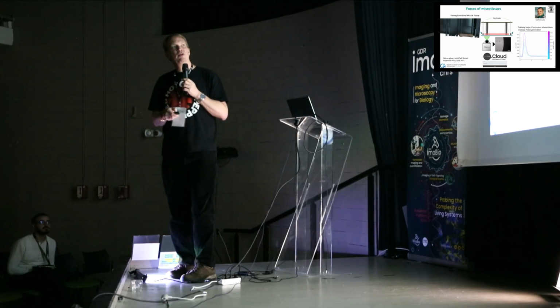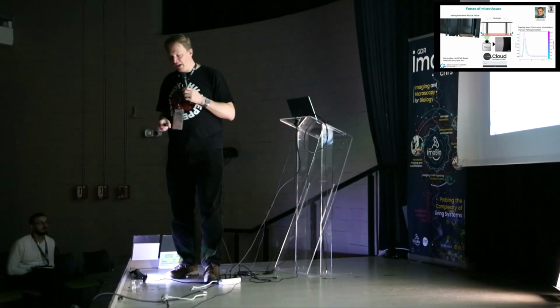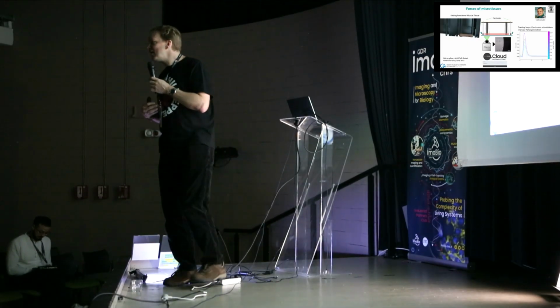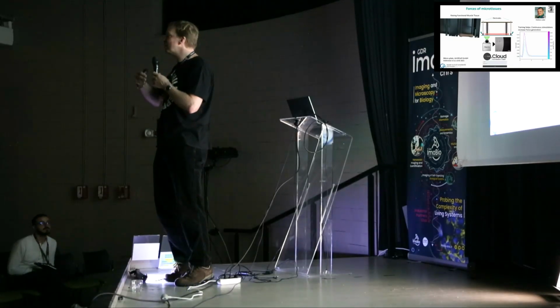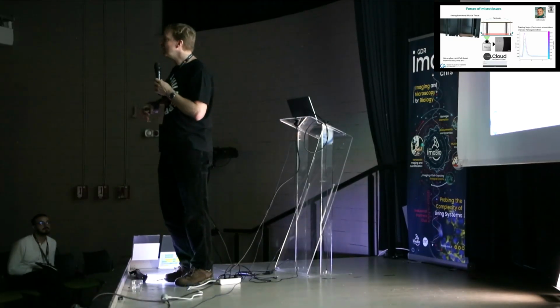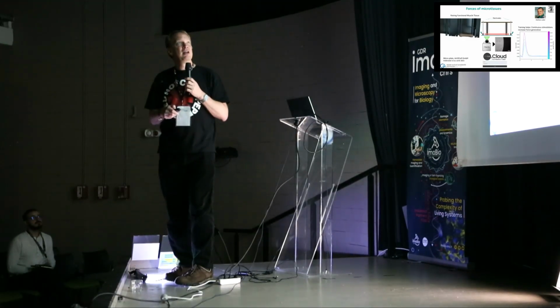And you can see quite nicely already after something like 20 hours, we have a strong increase in the forces. And that's exactly what triggers my attention, because I would like to know what happens here. Is this something that happens inside the cells? Is it a reorganization? Is it an expression of proteins that we see here? These are all the kind of questions that I love to look at now.